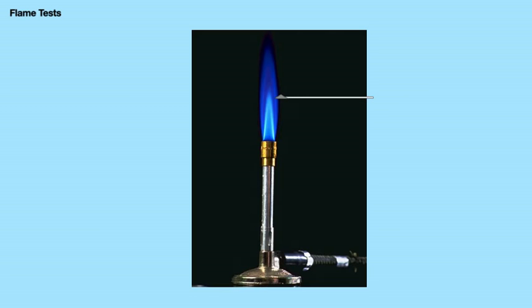You put the glass rod just at the edge of the blue flame of a Bunsen burner, like that. And what you find is the flame changes colour. Now the colour will depend on the metal in the compound. Some metals change the colour of a Bunsen flame to some very distinct colours, like that.